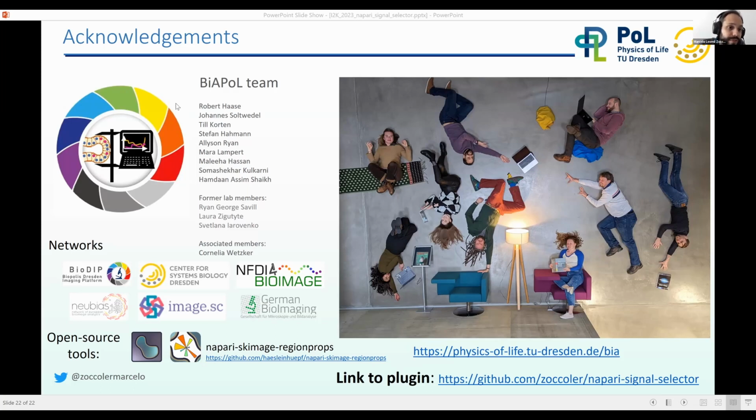There's a question from Augustine: does the feature table update if I were to modify a label? Good question, good idea. No. You can always update the table again, or provide a new labels layer with the updated table. For now, it doesn't update automatically, but that's a good idea.